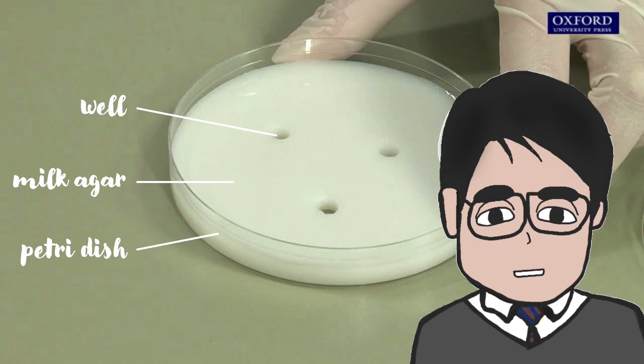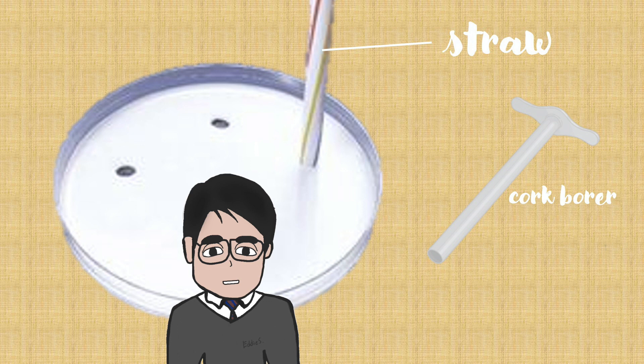Here is what a real milk agar plate looks like. In this milk agar plate, there are three wells. We can add protease solutions inside these wells. In order to make these wells, we can use a straw or use a cork borer to remove part of the milk agar on the milk agar plate.